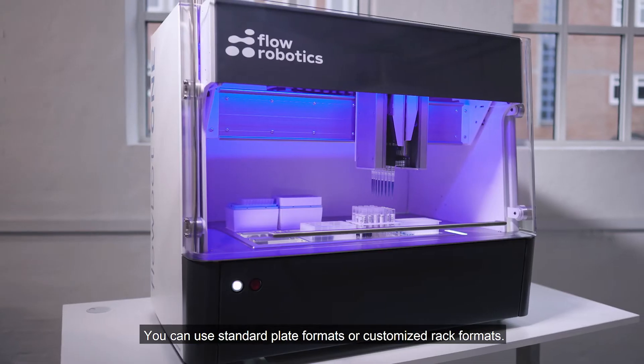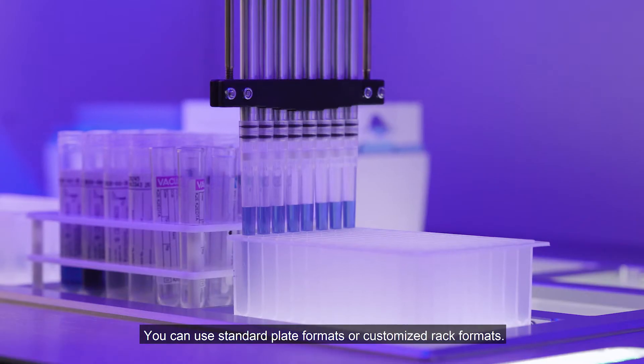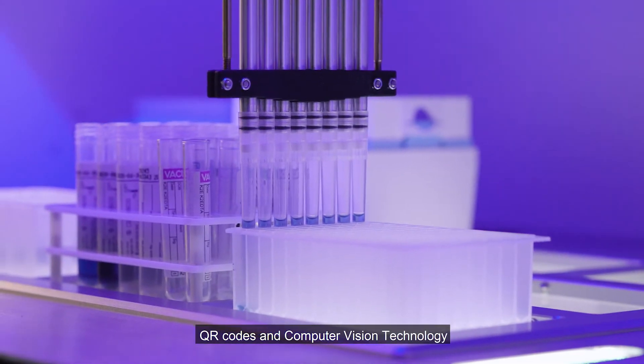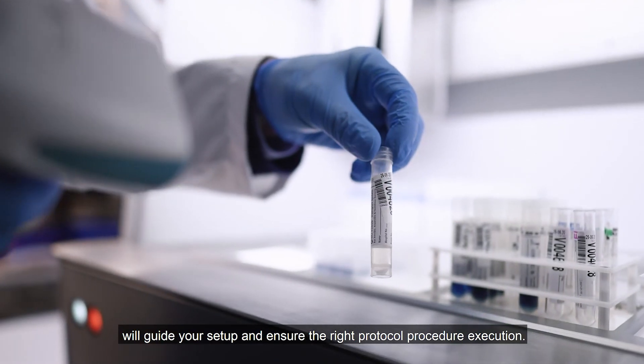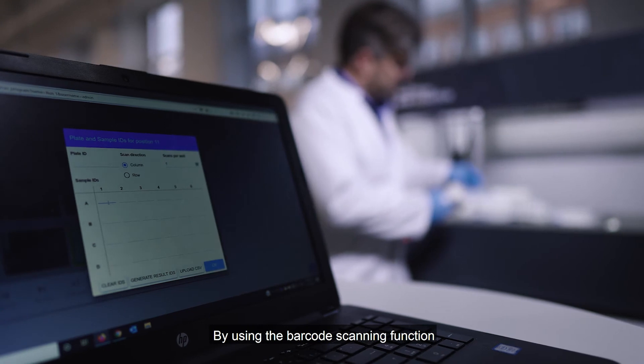You can use standard plate formats or customized rack formats. QR codes and computer vision technology will guide your setup and ensure the right protocol procedure execution. By using the barcode scanning function, you can ensure full traceability of your processed samples.